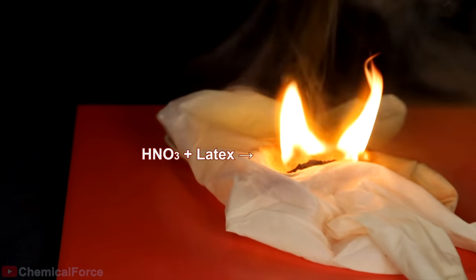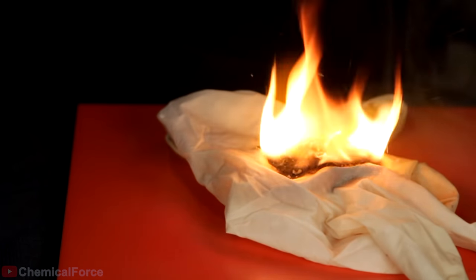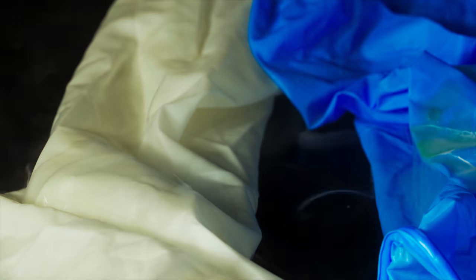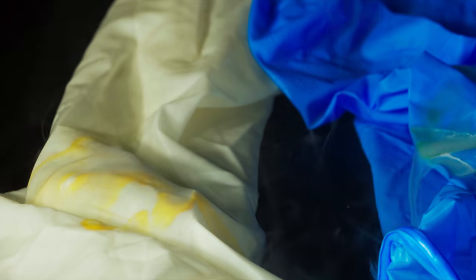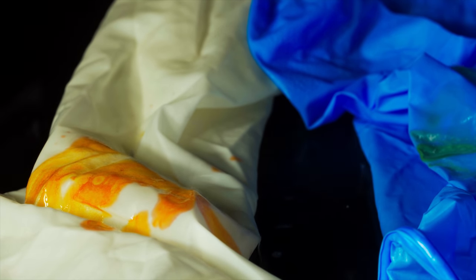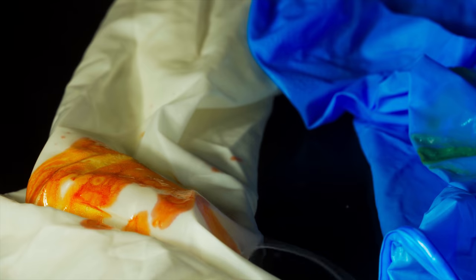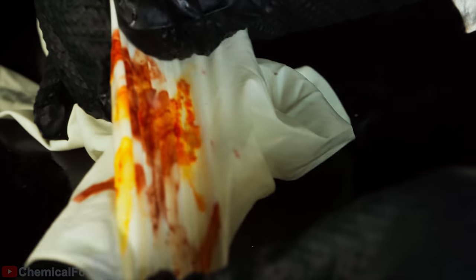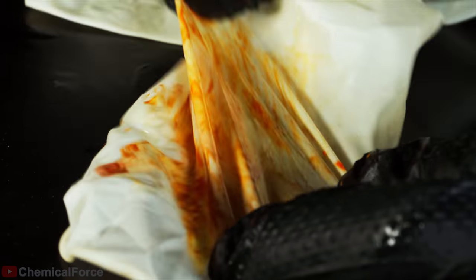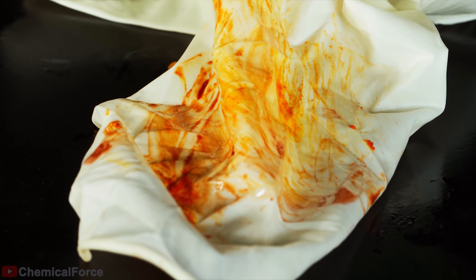Fuming nitric acid is able to set latex gloves on fire, but what can fluoroantimonic acid do with them? A long-time contact results in the color change, which clearly tells there is a chemical reaction with latex. However, unlike nitrile gloves, latex gloves turned out to be quite durable when being stretched. So, two pairs of latex gloves must be enough to protect your hands from accidental contact with fluoroantimonic acid.